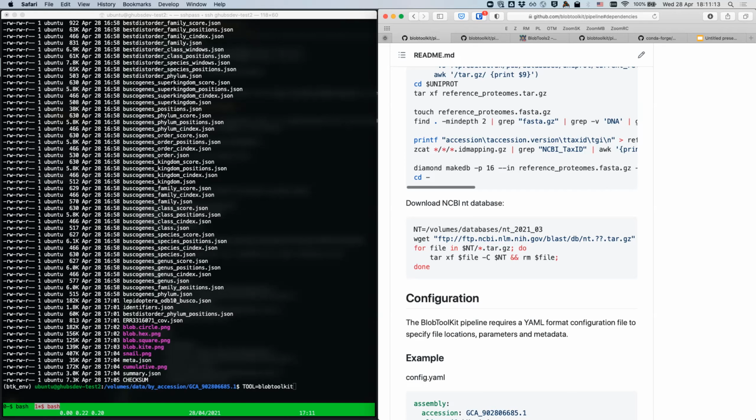Okay. And then along these lines, with your tutorial, would you mind providing also an example offline config YAML file? Yeah, so one where you're creating one entirely yourself. Yeah, an example of that would be an excellent idea. Great as well. Yeah, no, you're absolutely right.